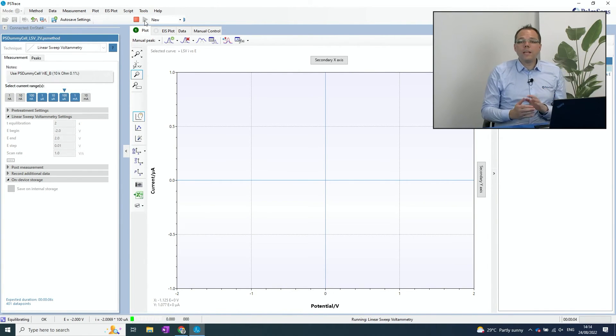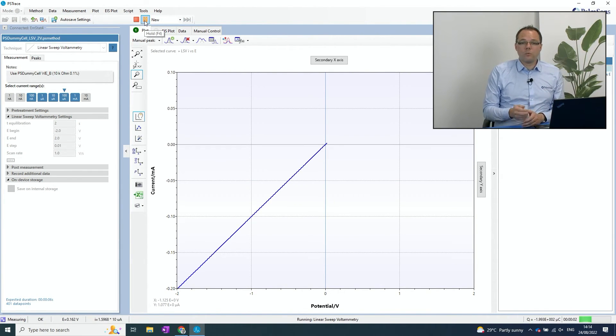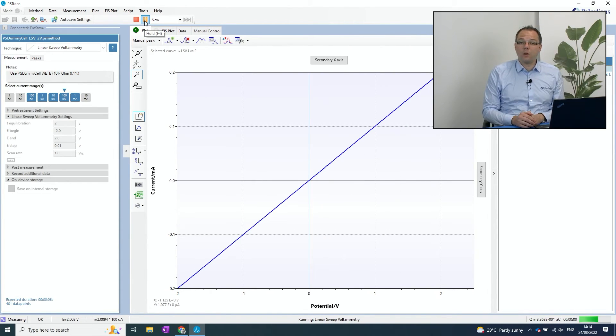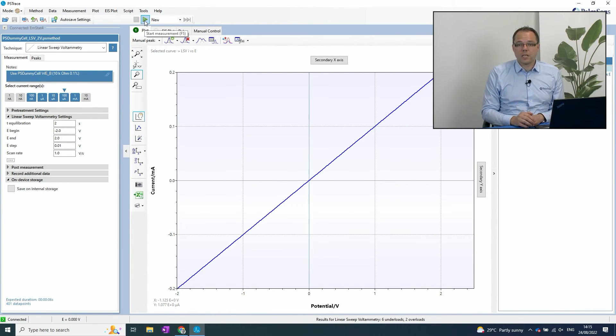So we're running a linear sweep voltammetry. We're sweeping the potential in a linear way and we have just a resistor connected. So according to Ohm's law, we're expecting a diagonal line in the graph of current versus potential and this is exactly what we see here. So just within a few minutes, we've not only unboxed the Emstat 4R, but already done our first measurement.